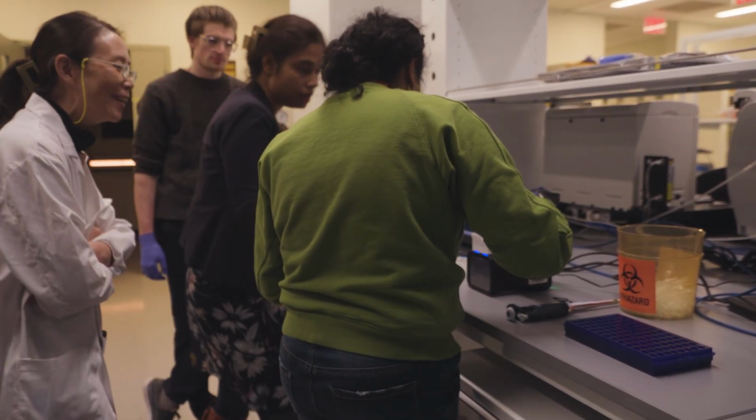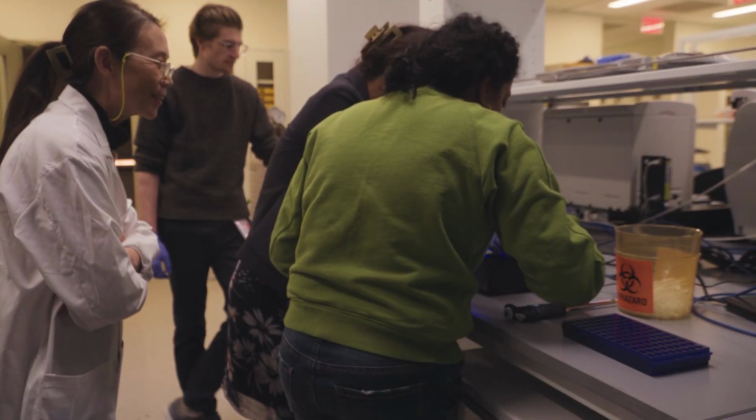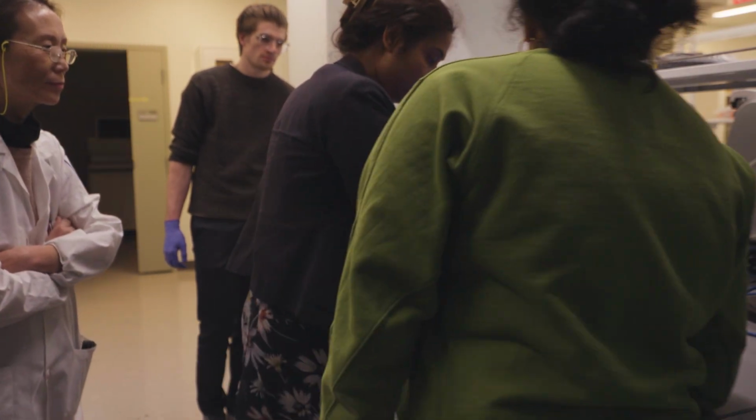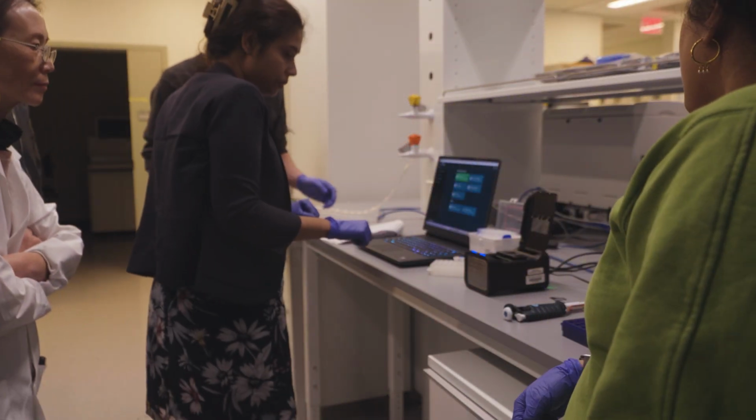How do I do it? Anti-clockwise, this way. Okay, so there is the light shield. Do you want to do it, Terry?